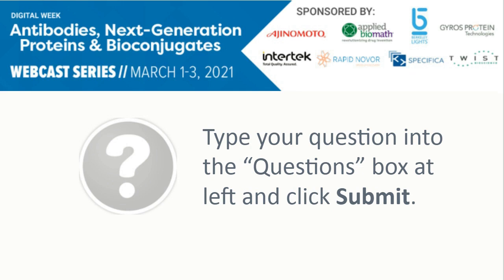Okay, great. And I think you just answered the next question, so let me go on to the next. In general, do mAbs usually exhibit higher affinities than the parental PAB? Yeah, that's a good question. We've seen that be the case anyway. The parental PAB, eh? It's an interesting choice of words, but yeah, certainly the case. When we did this rabbit immunization against the peptide of interest, that's what we found, right? Our ELISAs bore that out, that the couple of monoclonal antibodies acting individually outperformed the original polyclonal sera.